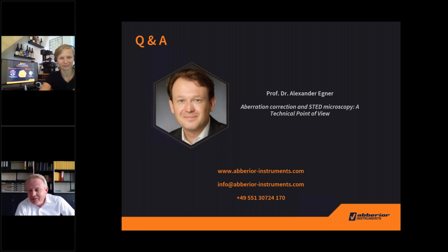So as I said before, it depends, right? If you're already very close to optimum conditions, you can just image the cell, so it will not move out of the optimum imaging condition. But if you are far away, then you always need the lines, because at some point you always need to get the information. Of course, it's also fine if you just pre-scan a bit and then jump back, and then you can record the whole line. So that would also be possible.